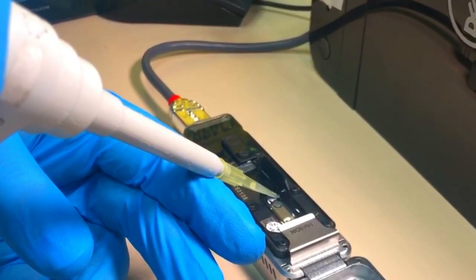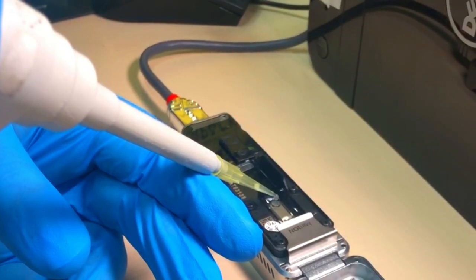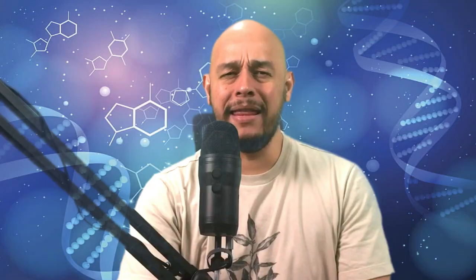Start the run in MinKNOW software. The sequencing takes one hour and the results can be analyzed in the software. By the way, there are two videos in the channel on how to prime the flow cell and how to wash the flow cell.